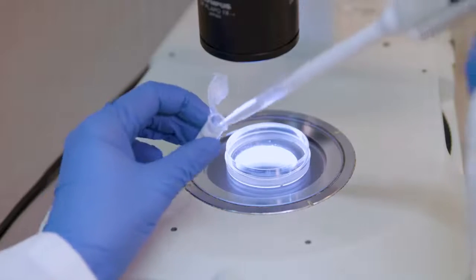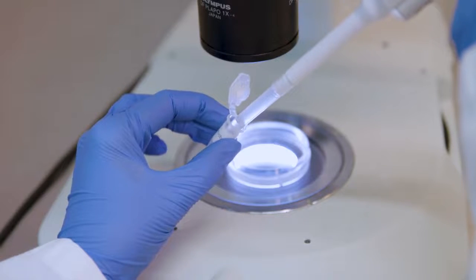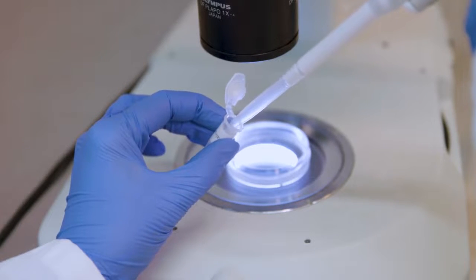This protocol provides a robust, reproducible model of α-Synuclein accumulation in primary dopamine neurons for studying the mechanisms and treatments that may regulate this accumulation. Preformed α-Synuclein fibrils induce progressive, highly reproducible protein accumulation.